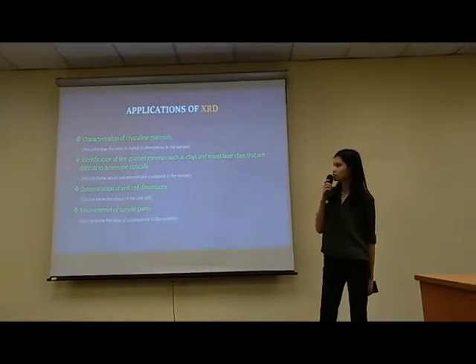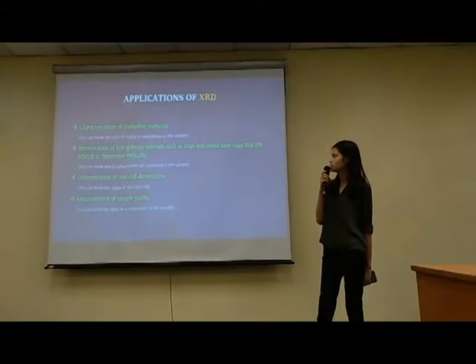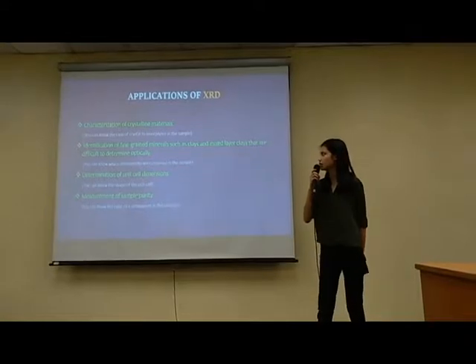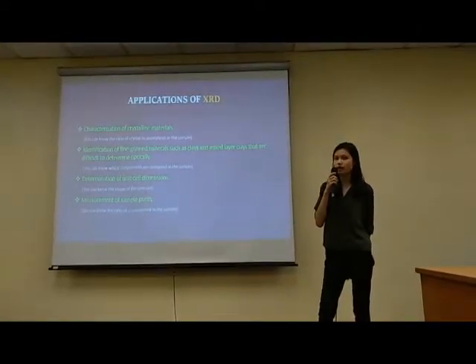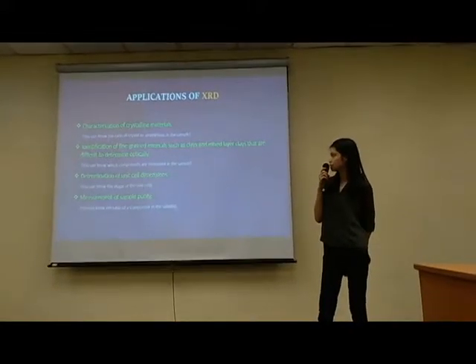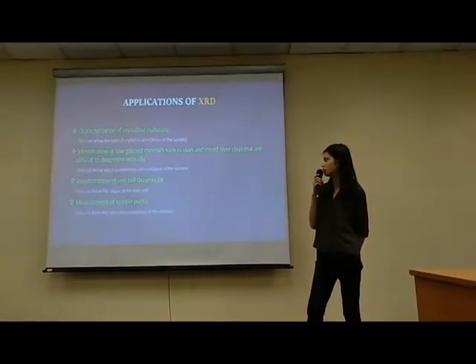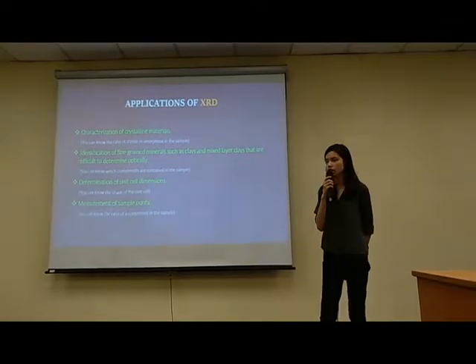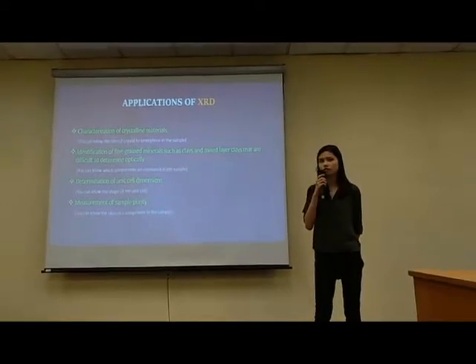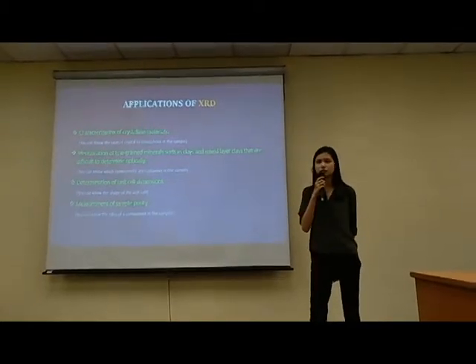And next, the applications of XRD. Firstly, the characterization of crystalline material, and we can know the ratio of crystal to amorphous in a sample. And second, the identification of fine-grained material such as clays, and we can know the components contained in the sample. And third, the determination of unit cell dimensions, and we can get the shape of the unit cell. And lastly, the measurement of sample purity, and we can get the ratio of the components in the sample.